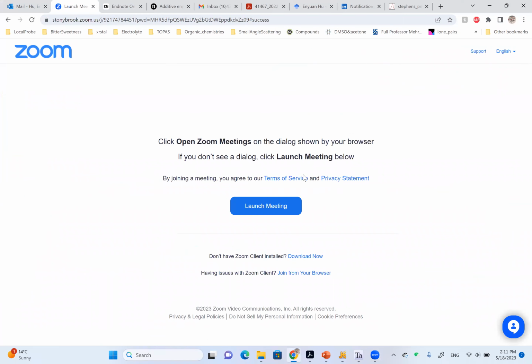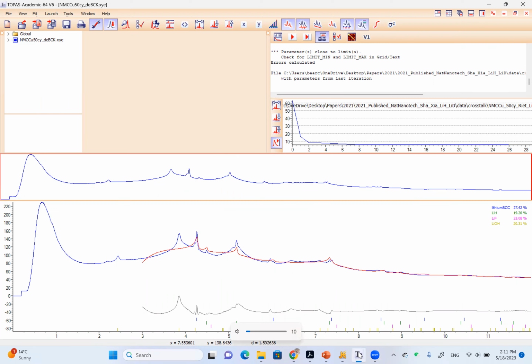Okay, great. So let me just run it. So we can first look at the data. Okay. What's this one?